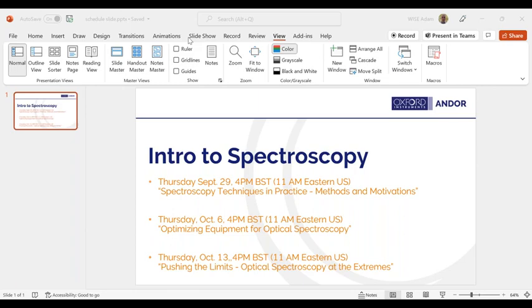But you could have a detector that doesn't necessarily separate light, but you could also mount a detector on a spectrometer. So I apologize. I should draw a distinction. I will make a note to talk about terminology more. A spectrometer has some sort of detector, but a spectrometer and detector aren't necessarily the same thing, or they're not always overlapping.